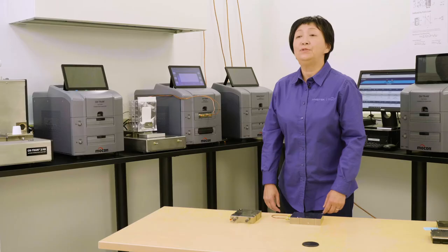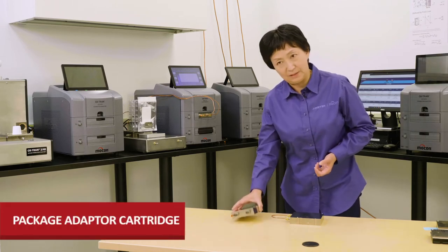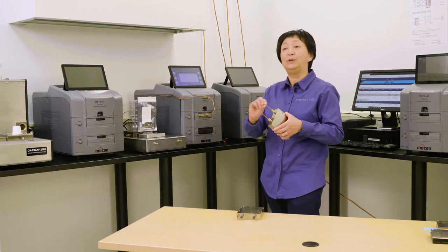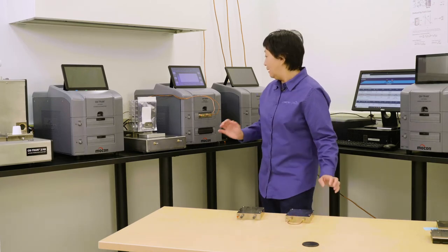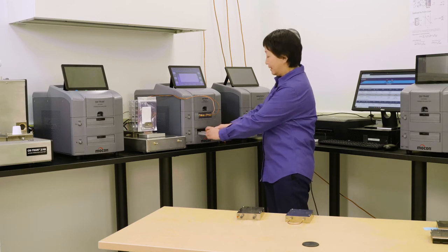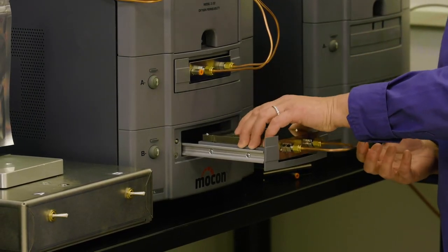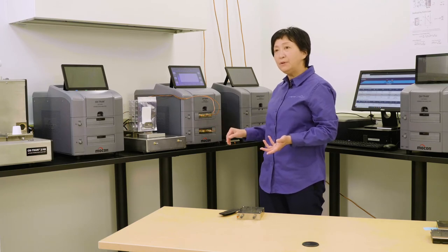Our next-generation film permeation analyzers can not only test film, but also test the complete package. What you need is called the package adapter cartridge. With a package connected on it, we can test the package. The cartridge comes with a complete set including a drawer and a removable gate. When the gate is on, you can test like a standard film test. When you remove the gate, you can put the cartridge with the package on it and push it in to test a complete package at ambient temperature for OTR or WVTR.